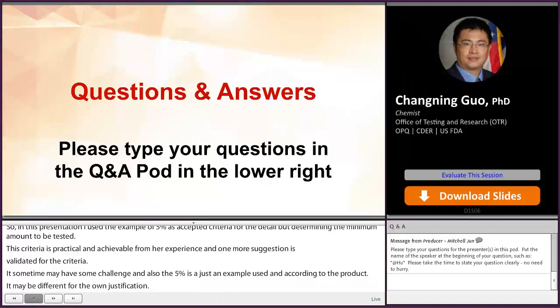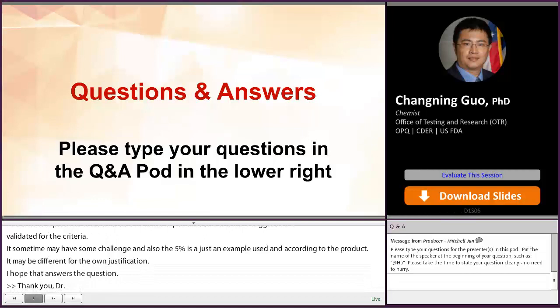Thank you, Dr. Guo. We have another question for you. Can Raman spectra help to identify the polymorphic form in a drug?